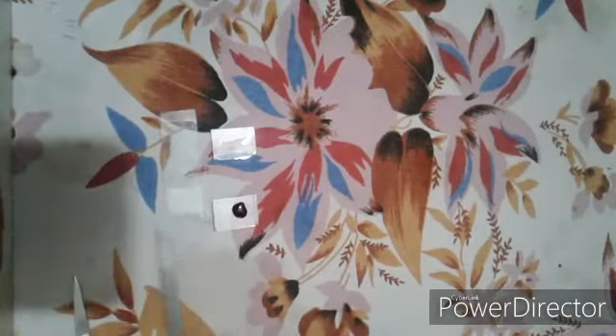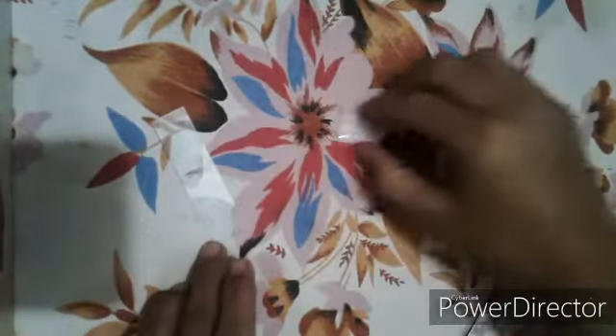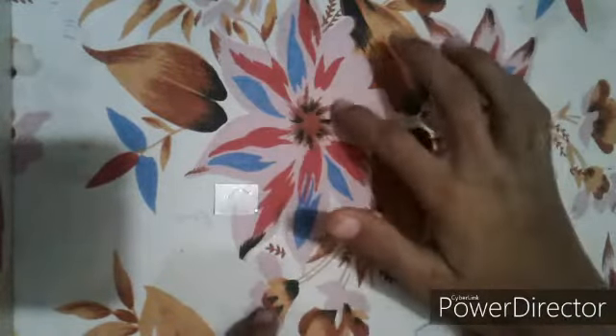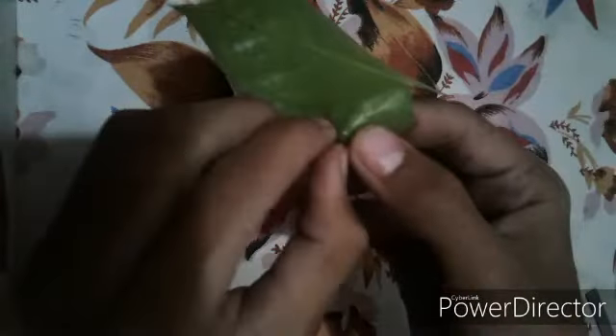For making the slide, first take the small slide on which you have put some drops of water, and now take our leaf. There is a simple process to taking out the stomata — I will clean it from here, and now I am going to peel it like this.